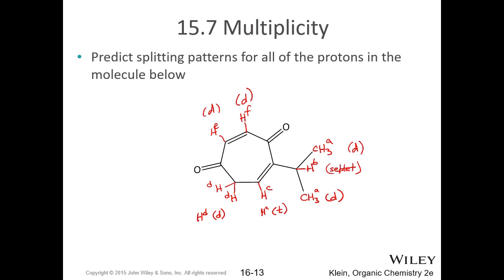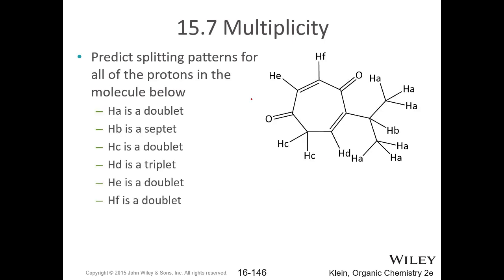This would be a 1, 2, 3, 4 bond, and we don't see that splitting. And so the next slide shows that a little more neatly. It's all typed there. It also expands the hydrogens to show clearly that we have 6 explicit HAs there. So that would be the splitting that we would see for each of those.